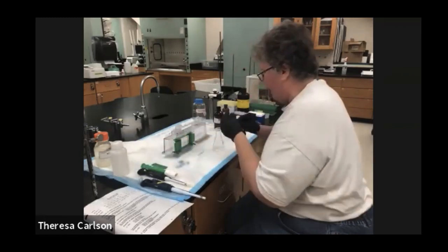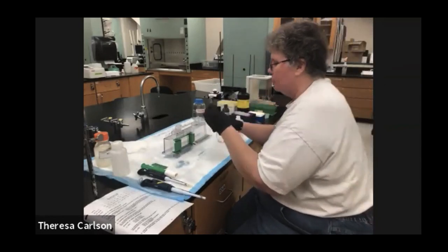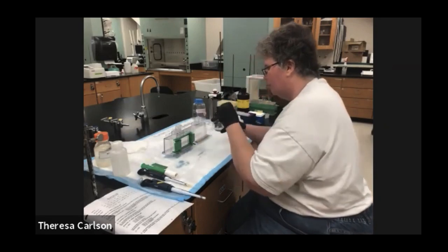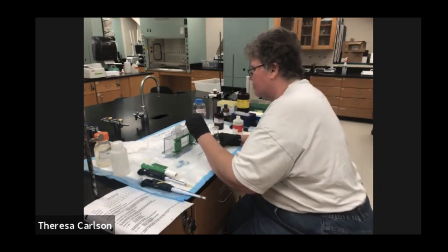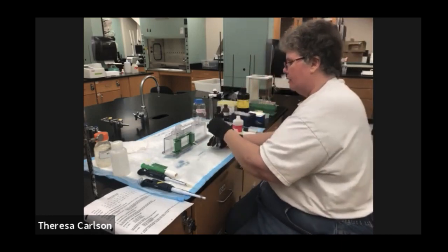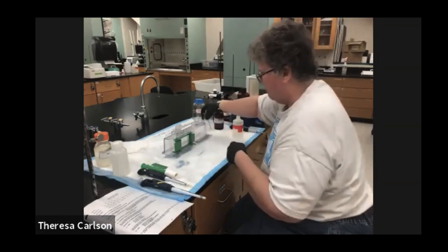And again, swirl it, and use a pipette to pipette it up. You're now pipetting it on top of the other gel, as much as you can. And remember, you want to do this quickly because it will polymerize. Just like last time, make sure you suck up a bunch in the pipette so that you can see when it is polymerized. When it's polymerized in here, it's polymerized here.